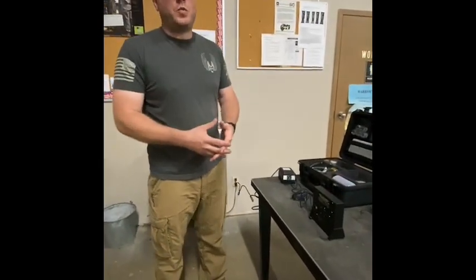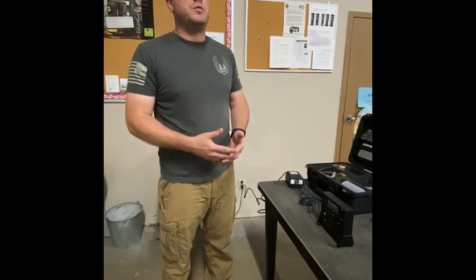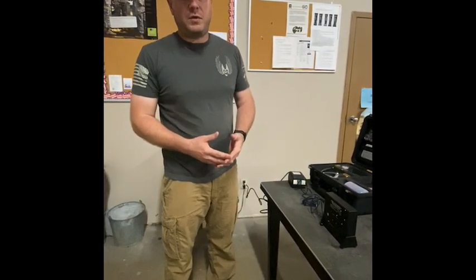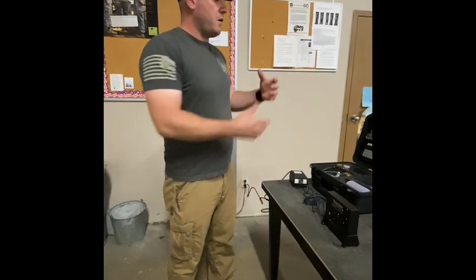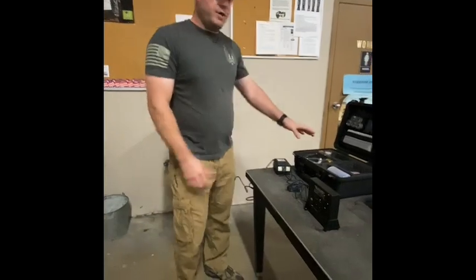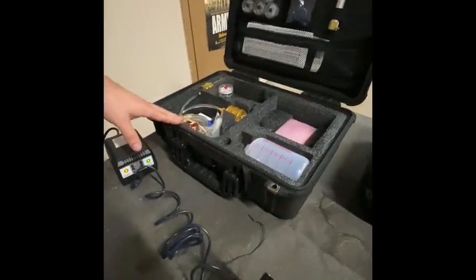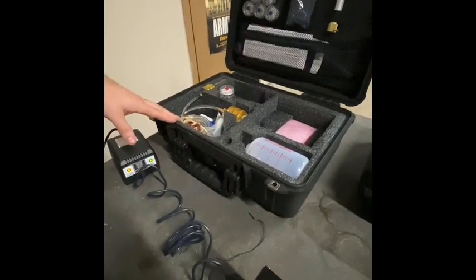However, if you deploy, many times we are going to be doing jobs that are not involved with pipelines. For instance, when I deployed, this was part of my job. I was dealing with aviation fuel. So what we have here is two of our standard, well, typical fuel testing processes.